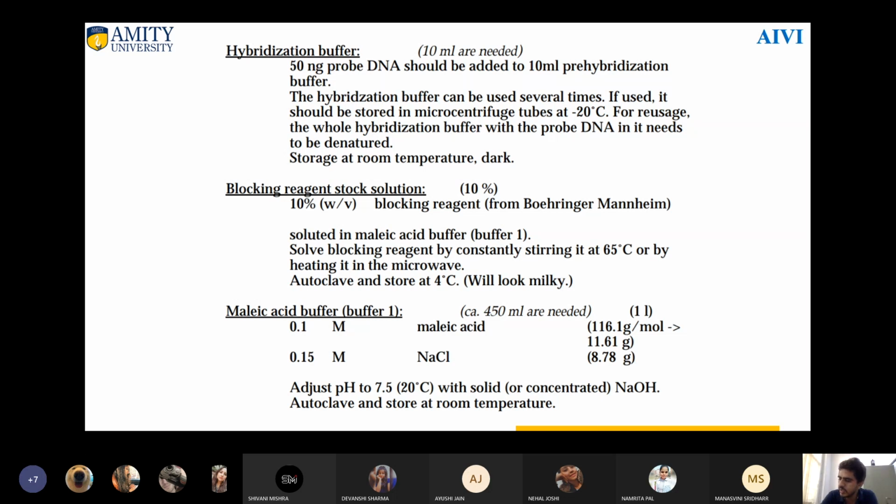binding, because as we mentioned, the transfer of DNA over the membrane is because the membrane has an interaction with your DNA. So if you add a probe to the nitrocellulose membrane, chances are that your probe will also bind to the membrane surface here and there. We do not want the DNA probe to bind here and there, non-specifically, through ionic interaction; the nitrocellulose membrane may absorb your probe. So for that we block. Blocking is a necessary process, so before going for hybridization, we first have to block.